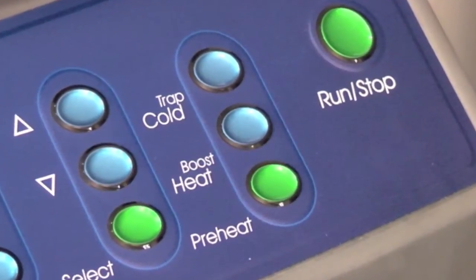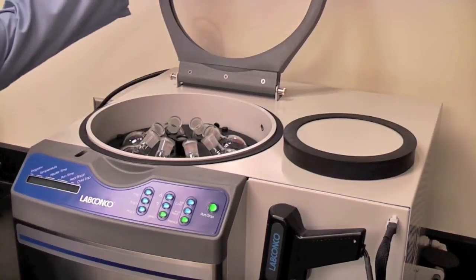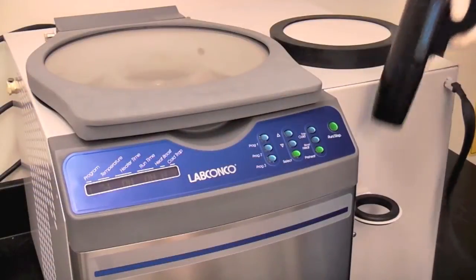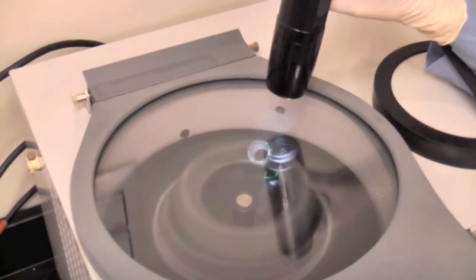A heat boost option is recommended for high boiling point solvents. The CentraZap strobe light saves time by allowing the user to easily see into the chamber to view samples while the rotor is spinning. Samples appear to be standing still.